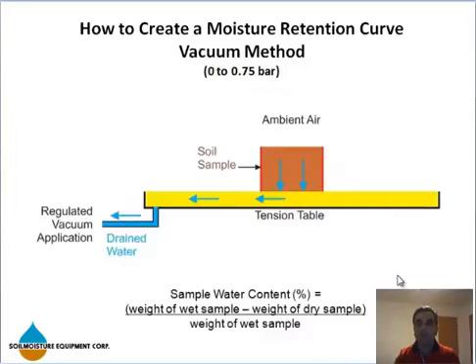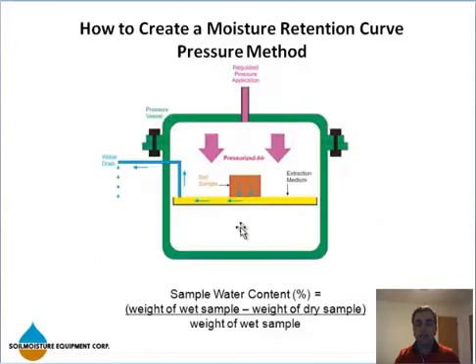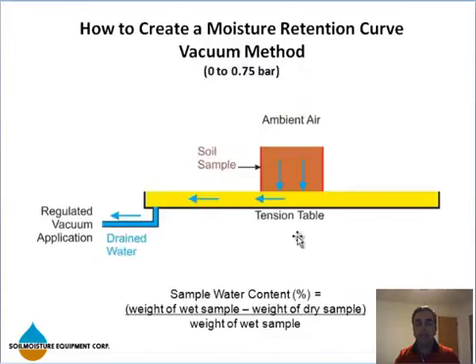In this slide you see a vacuum method. A vacuum method is very similar to a pressure method, except that so this is the pressure method and this is the vacuum method.